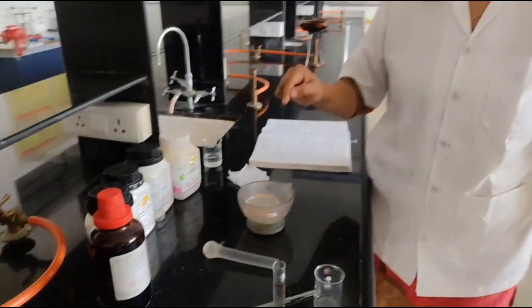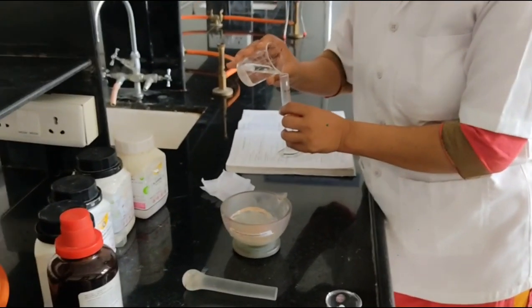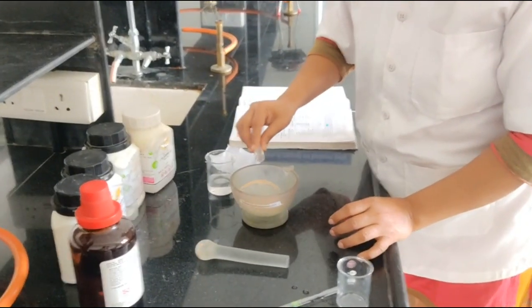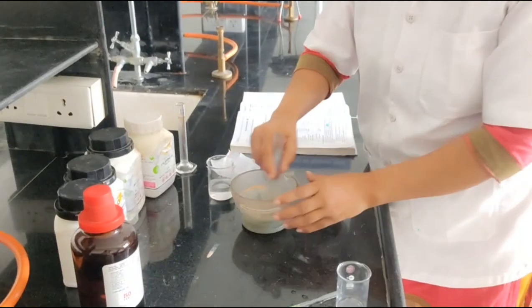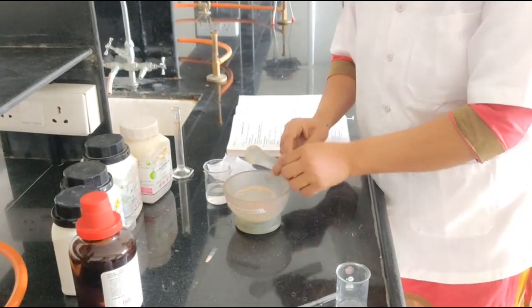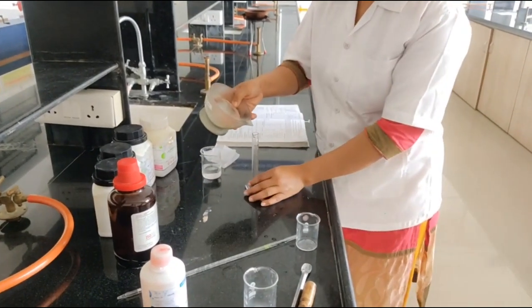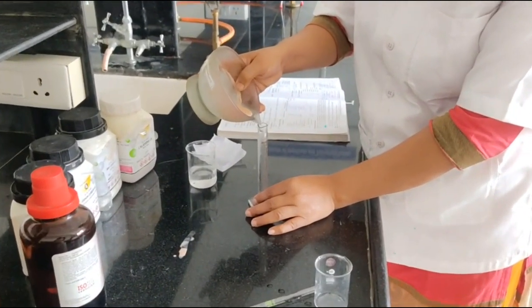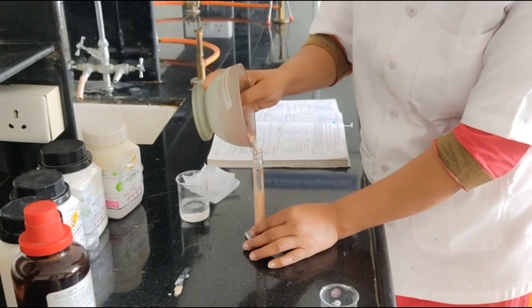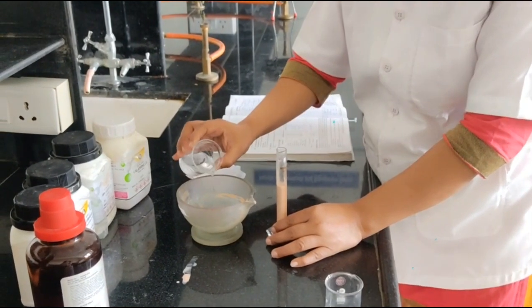Here we add only 7 ml of water. Then we again add the required quantity of purified water. We added a little bit of water and again triturated. And finally make up the volume. For that, pour our calamine lotion into the measuring cylinder. Add a little bit of purified water into that.